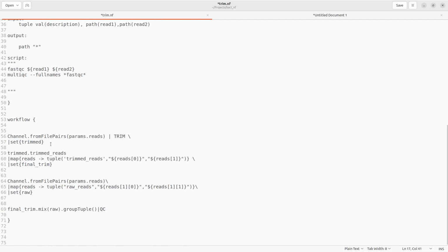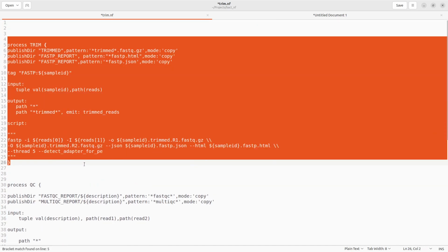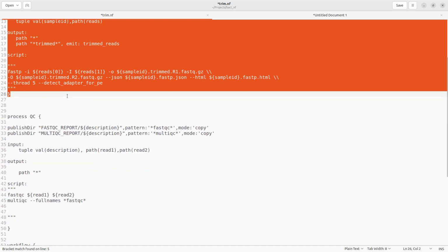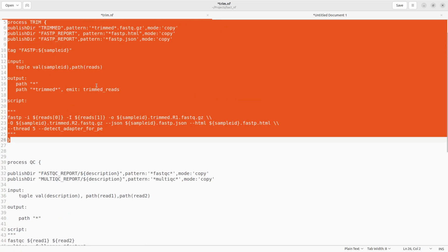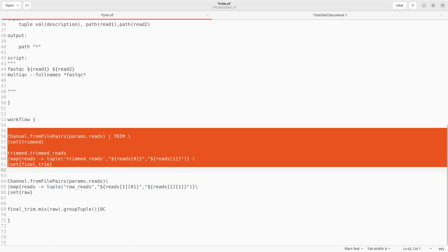to get that information. So .set is a variable that will be used to represent the process, this process here. Once we have this, it's possible to now refer to the trim reads. You see that's also here. So we are going to basically do everything here. What we need to do next is to make sure we get the trim reads. To do that, we'll basically follow these commands here. I will explain a couple of things here as well.